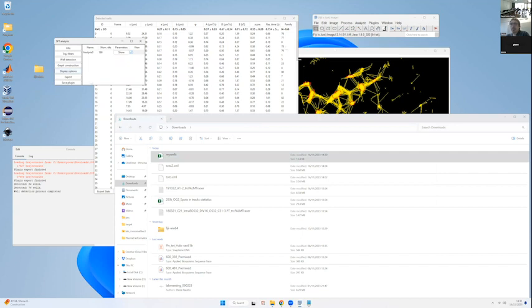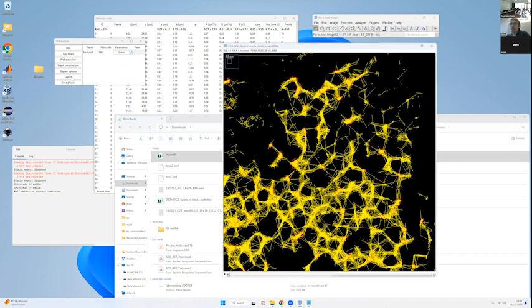Now, the second thing you can do is to directly export this image. So if we go to the export menu, and we have an analysis selected here, so I have my wells selected, I can choose to export the wells. But just exporting the wells alone is not really necessarily interesting, so I can choose to export also the trajectories.